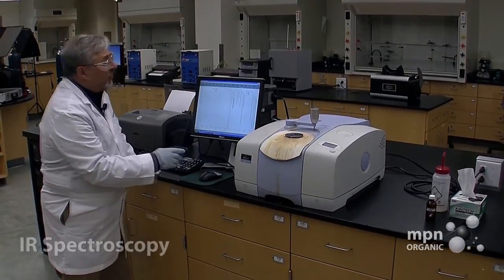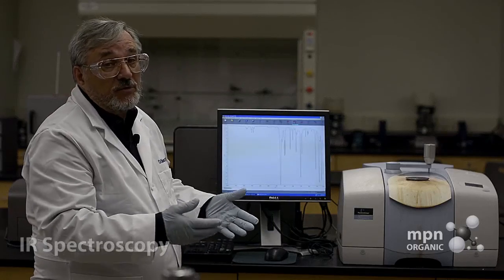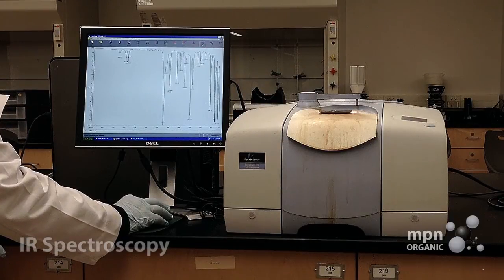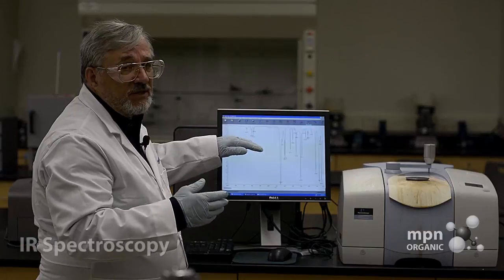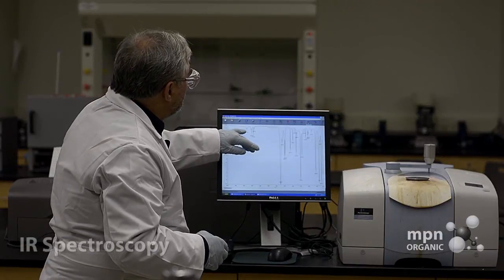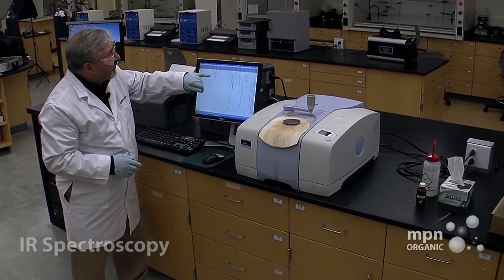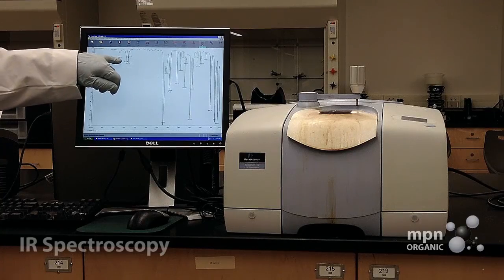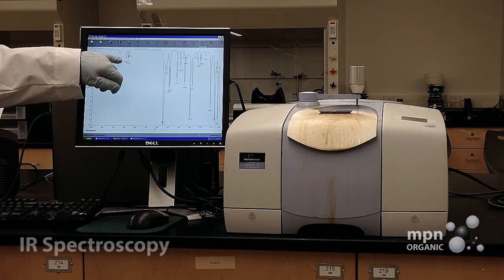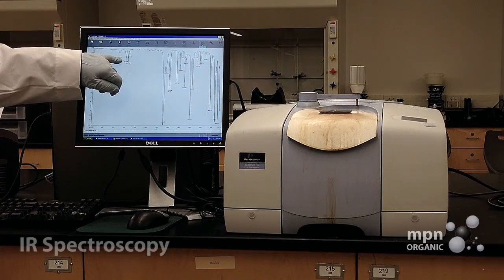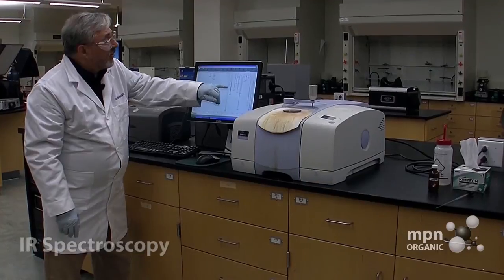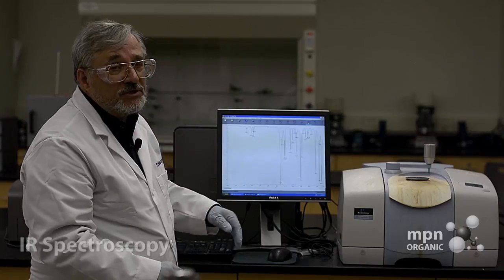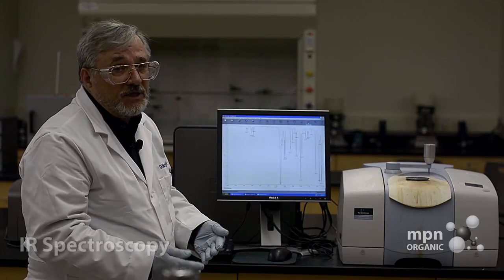So now we want to know where these peaks are. It's important to know where they are. And so we're going to then click the peaks. And you can see that we have this set for a threshold where even small peaks like this one here at 3,064 wave numbers is going to have a number associated with it. And so all of the important peaks now have numbers associated with them. And we can use this to identify benzaldehyde.